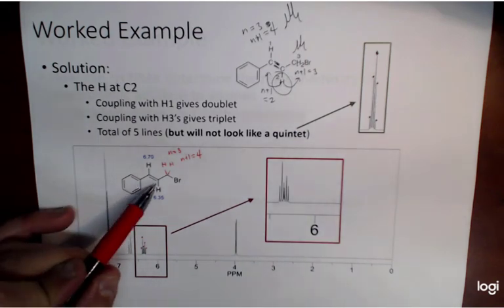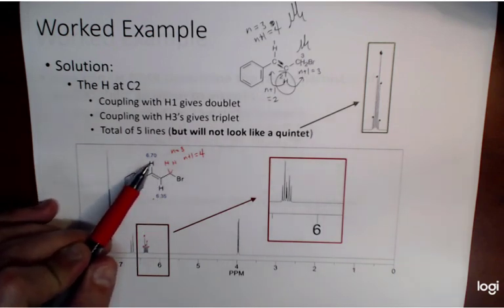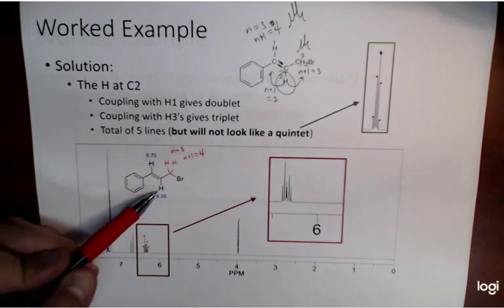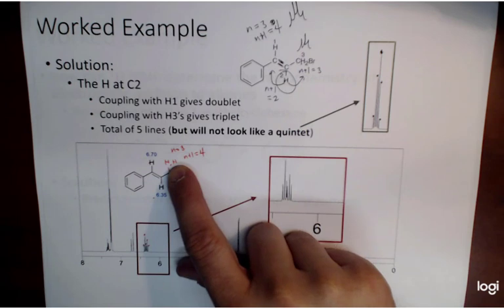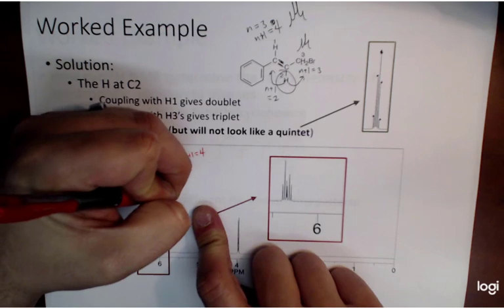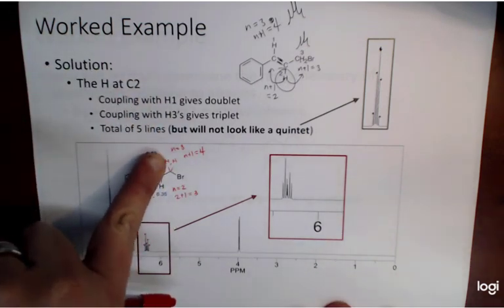And so that is because, yet again, remember, when you have this pi bond here, it will see these 2 at a separate instance than when it sees this one. Technically, I'm probably giving you the wrong terminology here, but I'm trying to help you. It sees these neighbors separately than when it sees that one. Okay, and so what happens here is you think about, okay, it has two neighbors here, so n is equal to 2. So on this side, n is equal to 2, so you get 2 plus 1 equals 3. So at that instance, it gives you a triplet.